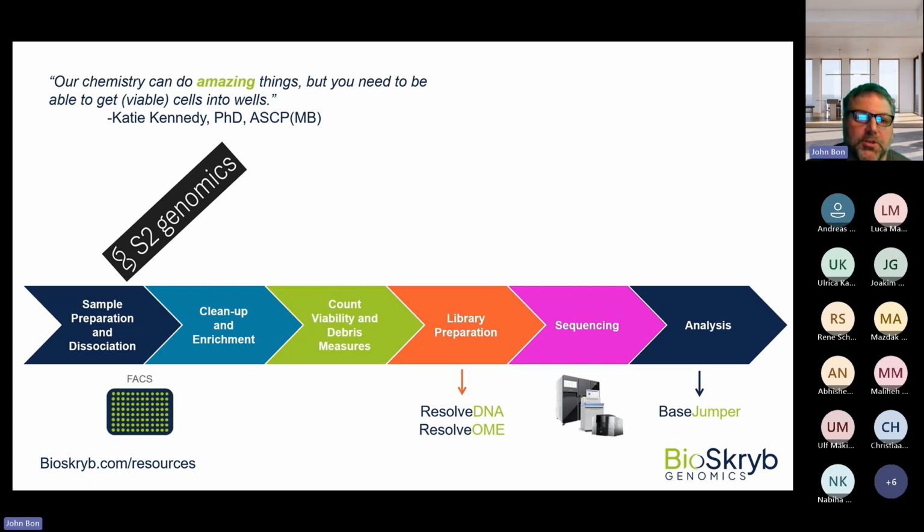So sample preparation is very important. The FACS is very important. As Nabiha said too, viability is very important. Another system that works well is the Levitas, or you could just do dual viability staining with propidium iodide and calcein AM. That's what we use mostly internally, but we also use other means to check for viability. The viable cells will produce the best data. So it's very important upfront: you want good healthy cells or fresh frozen cells for our technology to work the best.